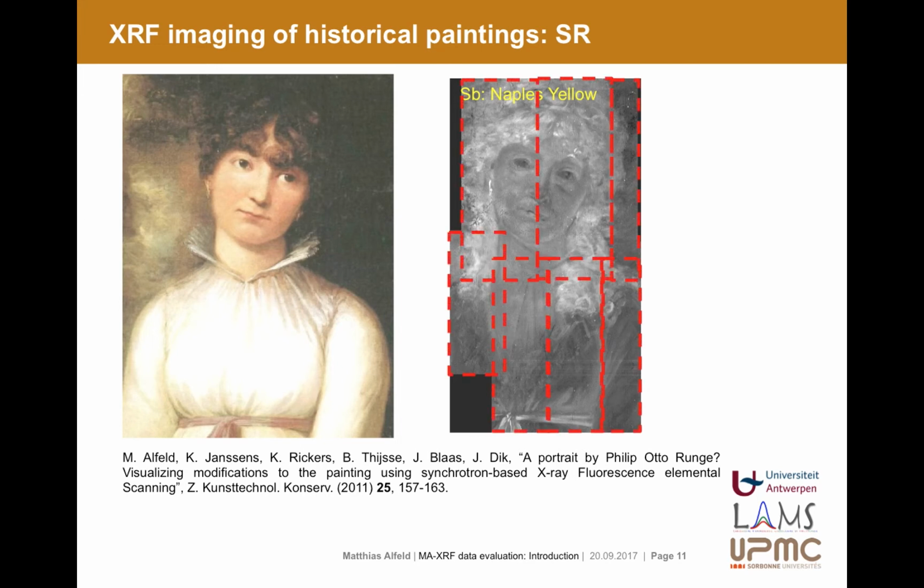For several reasons, we took in total 7 scans to acquire this image. And now processing this data, step by step, meant always starting the process manually anew. And so I fitted the torso, I fitted the face, and then I came there and I noticed that there are chrome-containing repairs. And as I only noticed them in this spot, I could not be sure that they were not also in the other scans as well in very minor details. So I needed to reprocess the entire data set, which took me 2 days, left me very frustrated with the will to improve.